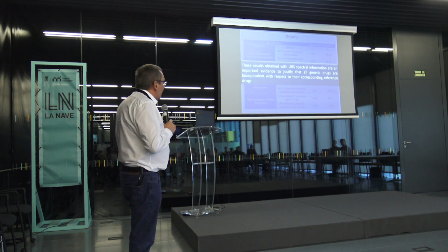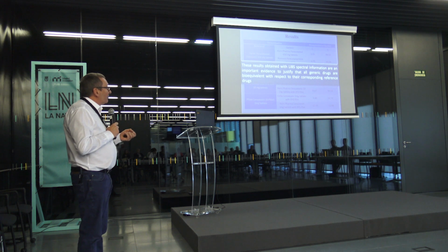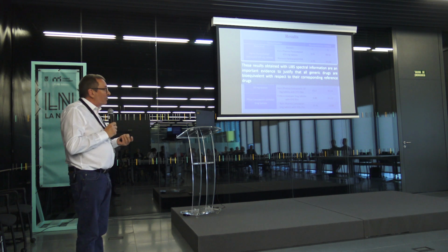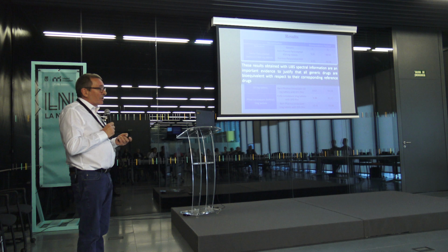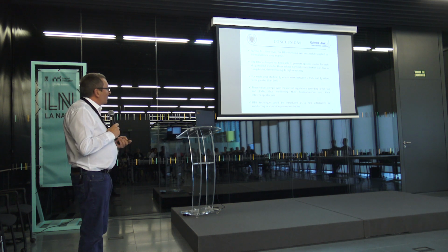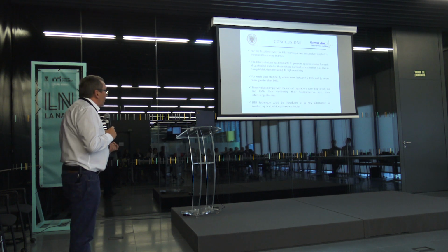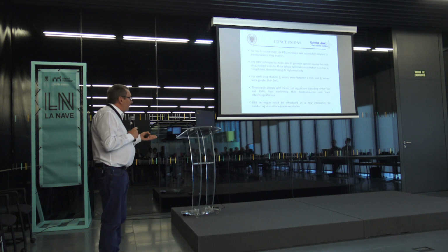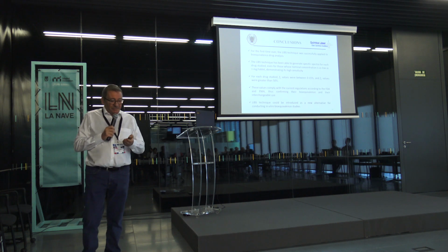The results obtained using LIBS spectral information are important evidence that justifies that all generic drugs are bioequivalent with respect to their corresponding reference drugs. This is the first case of the LIBS technique being successfully applied to bioequivalent drug analysis, and the LIBS technique could be introduced as a new alternative for conducting bioequivalence studies.